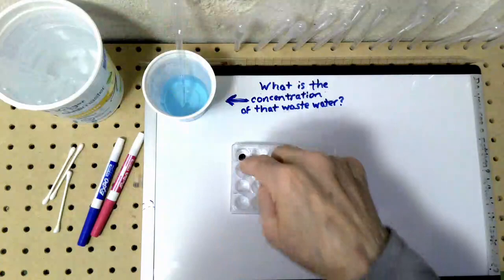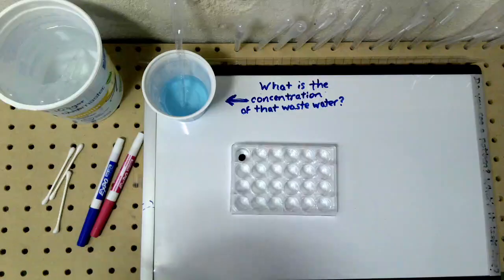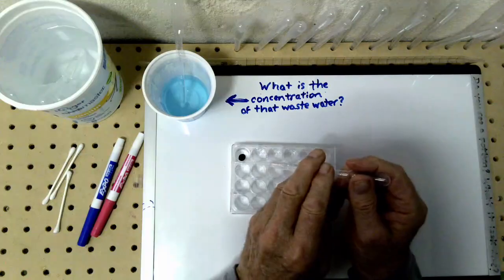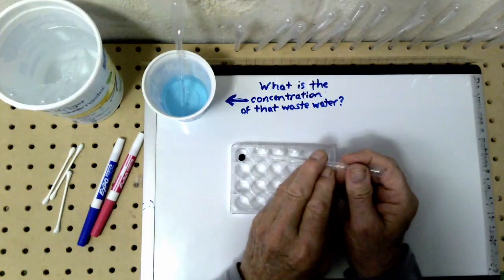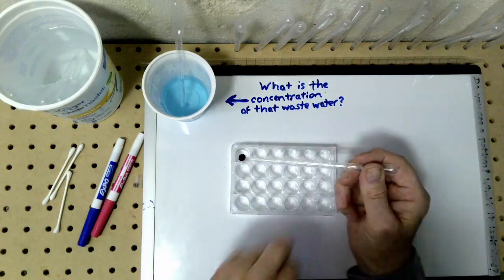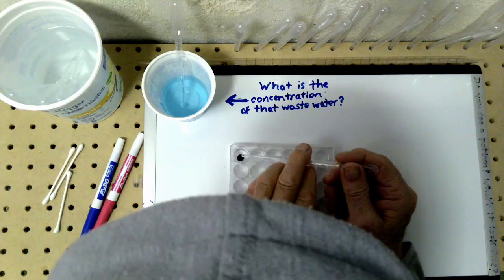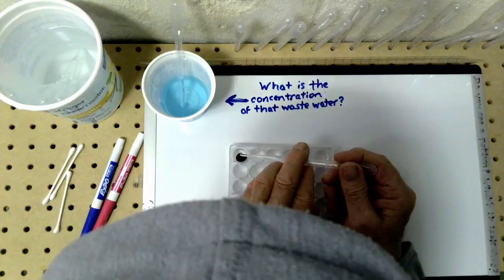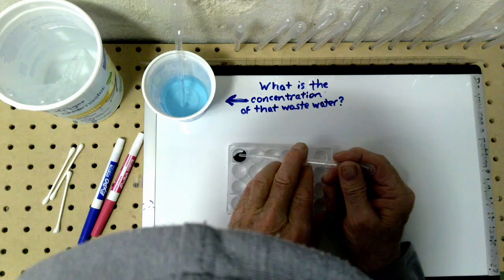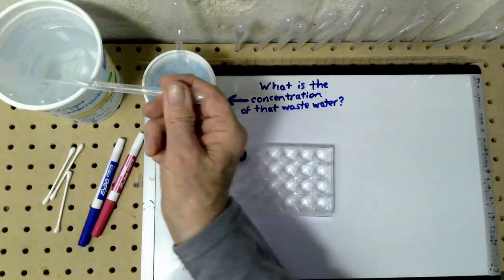Let's grab some water here. These are micropipettes. We can use them counting drops here. So here we go. I'm going to start counting the drops. I'm going to get my glasses on first. Multiply what I see here by 3.25. So 1, 2, 3, 4, 5, 6, 7, 8, 9. I'm almost thinking to go to 10 myself. So there's 9 right there. Okay?